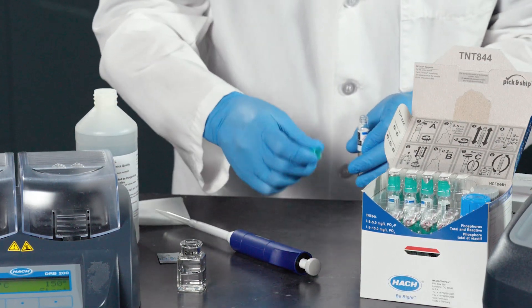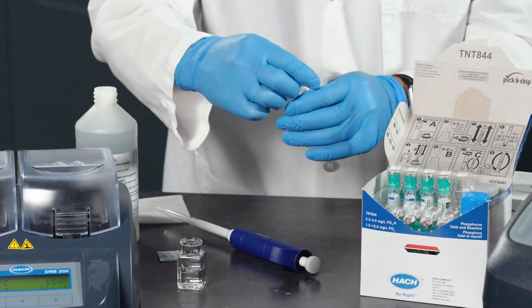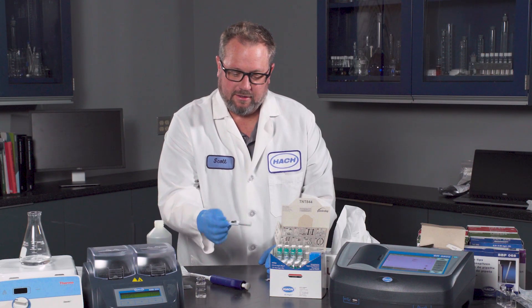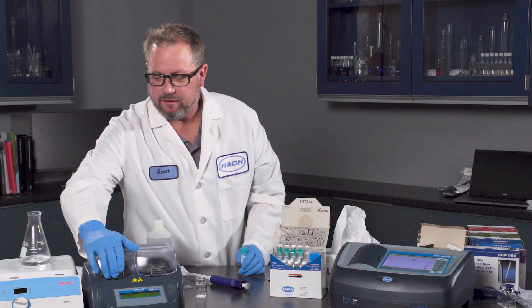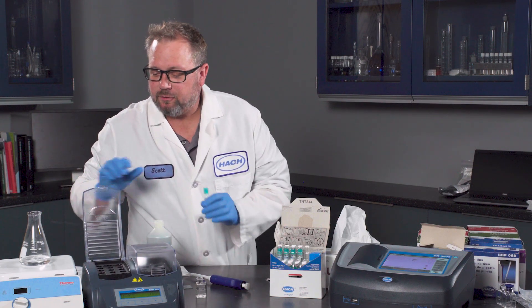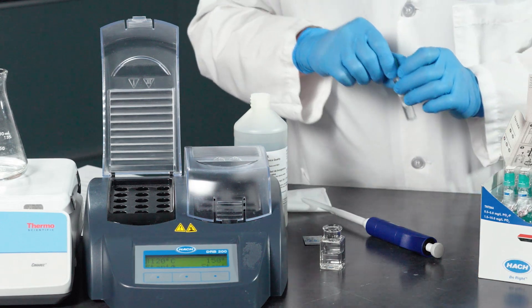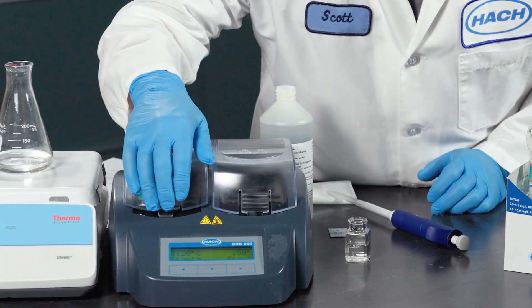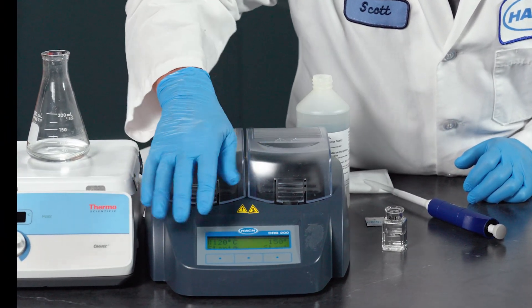Then take the foil off the dosycap, put it onto the vial, invert a few times to get that mixed in. As you heard, the heater block DRB has reached temperature. Place this in and do the digestion for 30 minutes at 120 degrees Celsius.